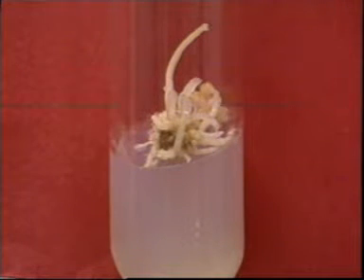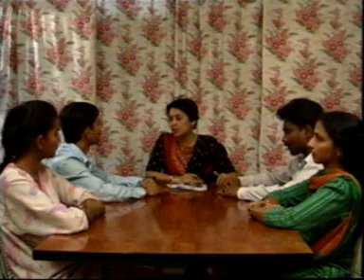Madam, I am working on problems of tissue culture related to plants like groundnuts and orchids, and sometimes I get a condition in which the tissues appear to be glossy, and they look as if they are translucent and hyperhydric, and these plants don't grow properly. Now, as you have said that they are hyperhydric, this hyperhydric condition is due to excess of water logging into the tissues, and because of that many physiological disorders arise and these tissues fail to grow normally. To solve this problem, here is a graph that I have presented, and that tells you what are the causes that give this problem and how it could be solved. It can be solved by the temperature, or by altering agar concentrations, or by reducing ammonium concentrations, etc.